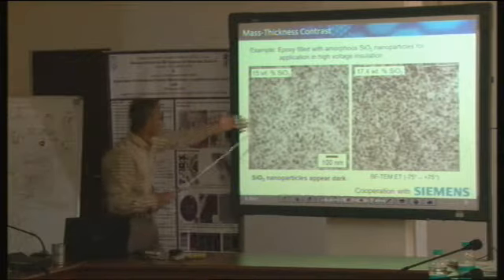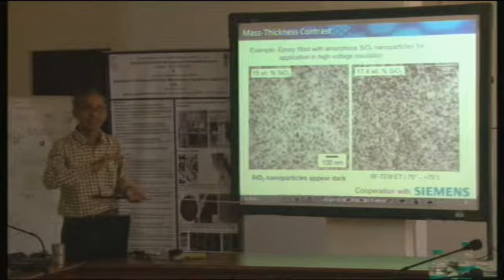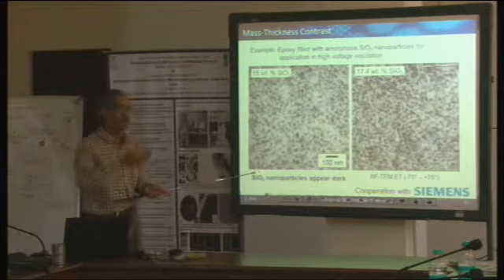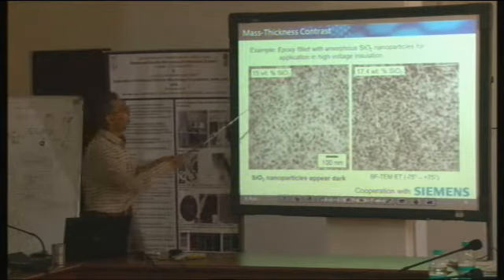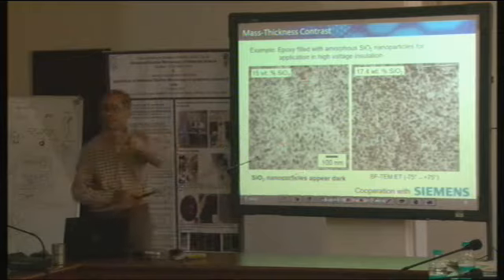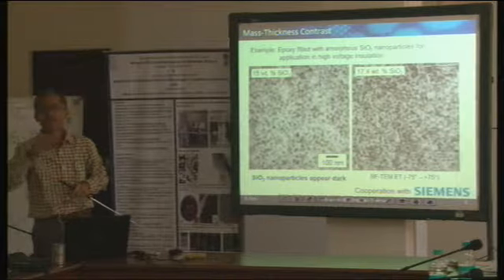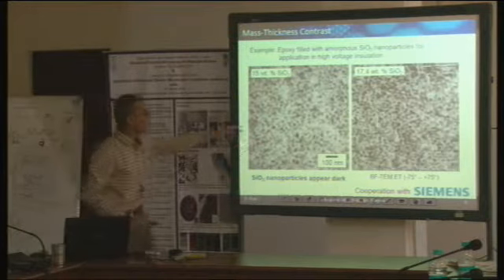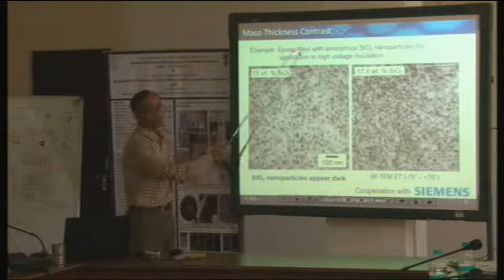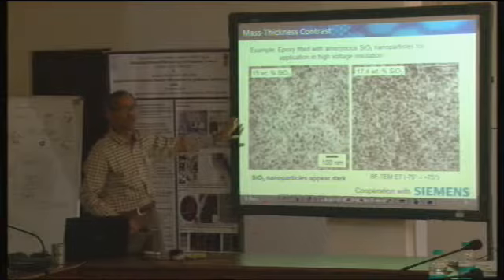that diffraction contrast, had these silicon dioxide nanoparticles been crystalline, then some of these nanoparticles would have looked much darker, some of them would have looked less dark. They might all have probably looked darker than the polymer, epoxy, but there would have been variation in the darkness of the silicon oxide nanoparticles had they been crystalline, depending upon their orientation to the electron beam and whether they are favorably oriented for diffraction or less favorably oriented for diffraction. But right now that mechanism doesn't come into the picture. The only contrast mechanism is the mass thickness contrast, and that's why I get this kind of image, where all the nanoparticles look more or less uniformly dark.